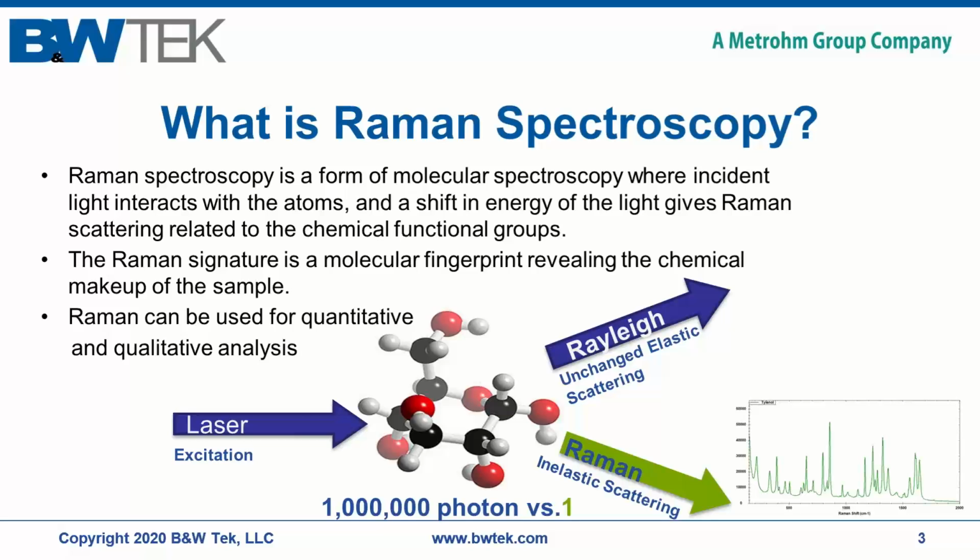So Raman spectroscopy has a great advantage of giving us so much information with direct measurements on samples. We don't typically need to do sample preparation. It is non-destructive, and we can measure through clear and transparent containers to get that Raman spectrum. It's quite a rapid method by which we can get information about multiple chemical components in a system all at once.